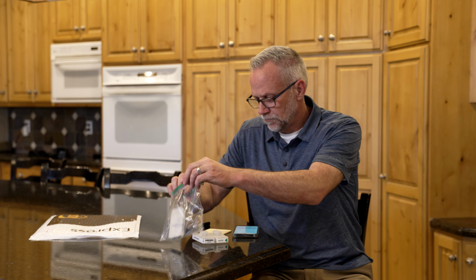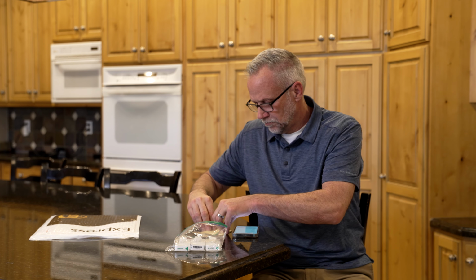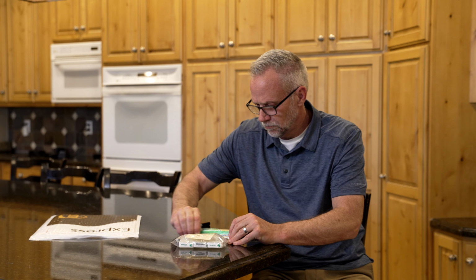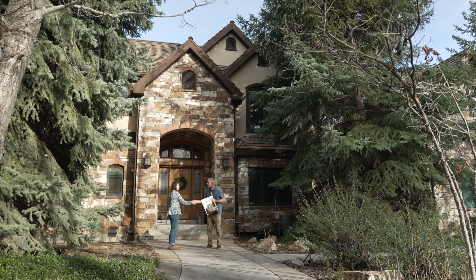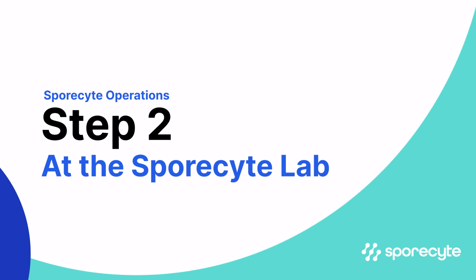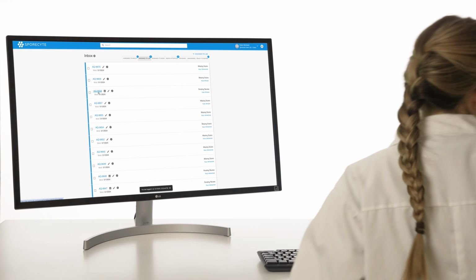Now, prepare the samples for shipping. You may use your own shipping provider and materials, or purchase shipping supplies from Sporecyte. Place all the samples and your order number from the app in a shipping envelope and ship them to our laboratory. As soon as we receive your samples at the lab, our lab technicians enter the data into our system and send you a confirmation email.